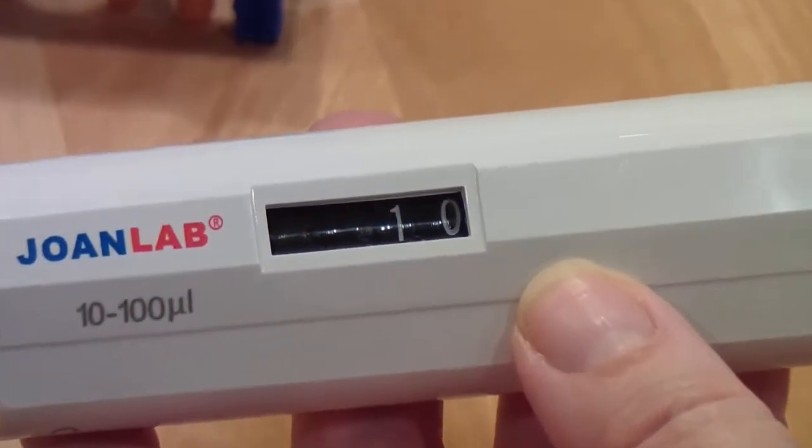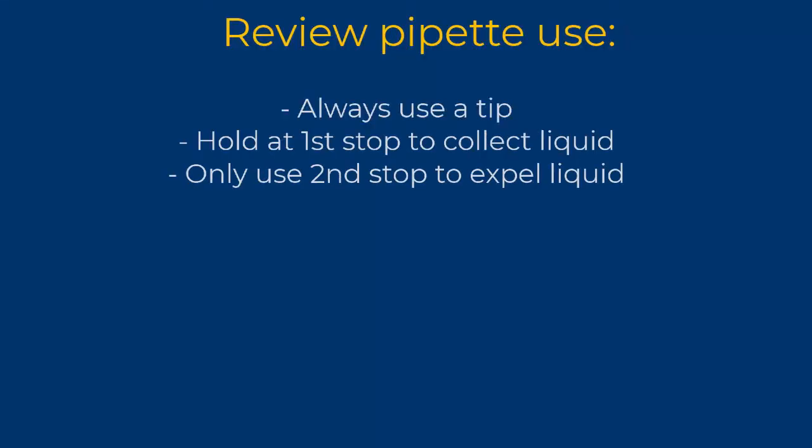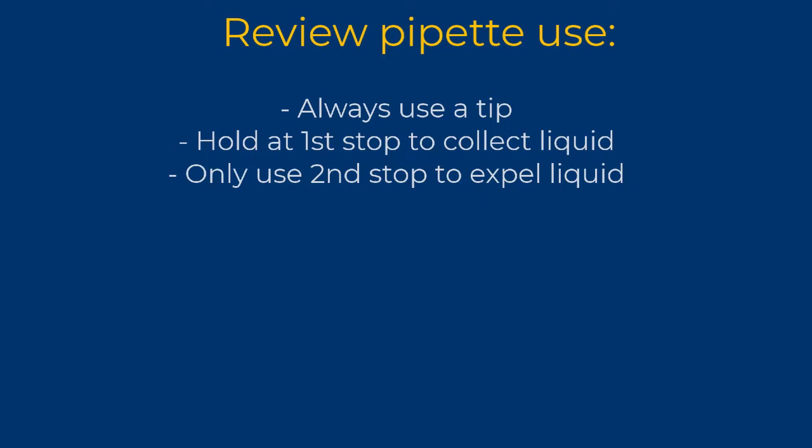Set the pipetter to ten microliters. Be sure to stay at the first stop. Remember, only go to the second stop when you are trying to eject all of the liquid and leave the tube at the end. Notice how, when you have such a small volume, the first stop is a very tiny movement.